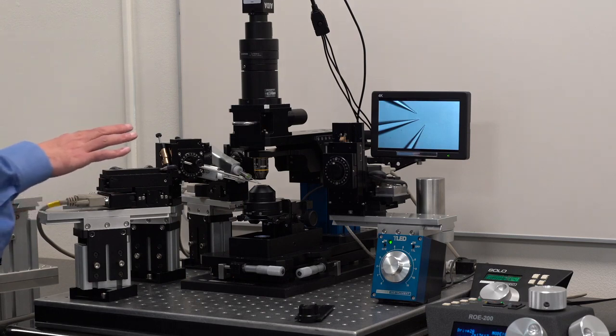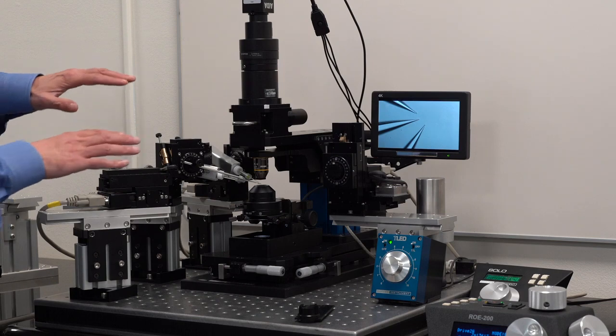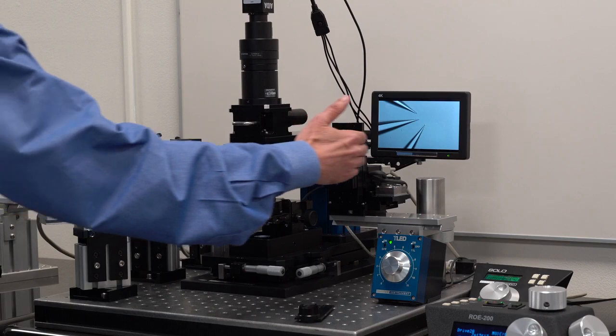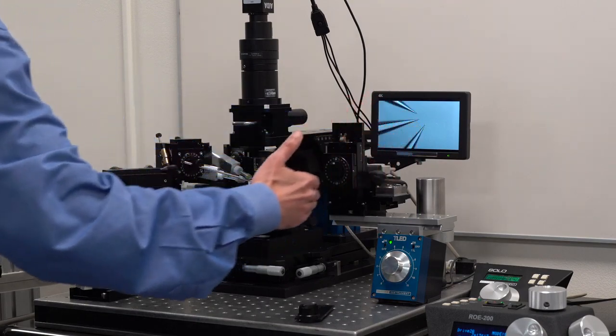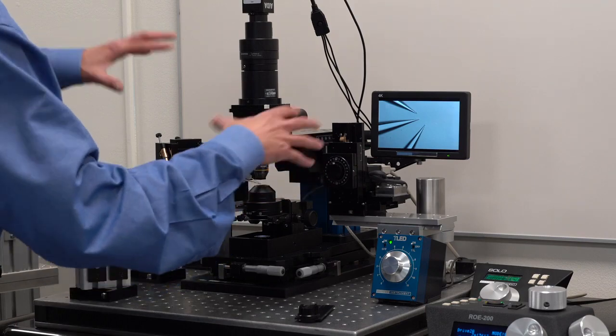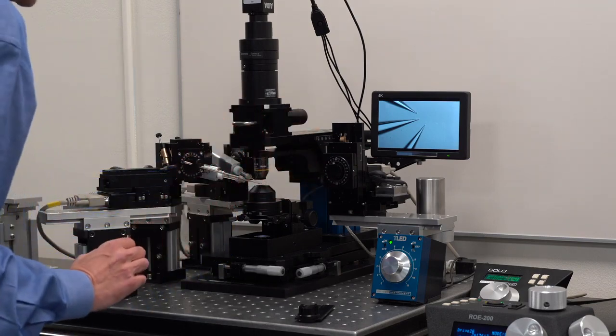The reason to have a narrow format manipulator is exactly for setups like this. As you can see, I can put three on this side. And if I wanted to, I could put three on the other side and have six probes going into the sample.